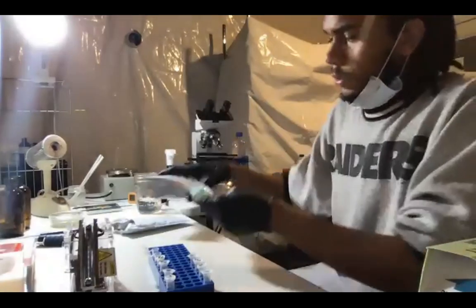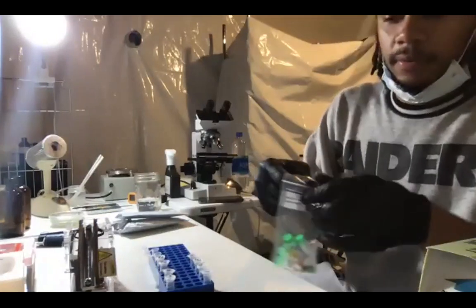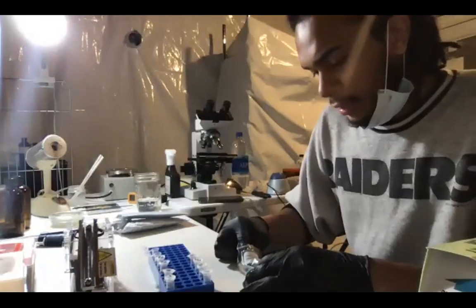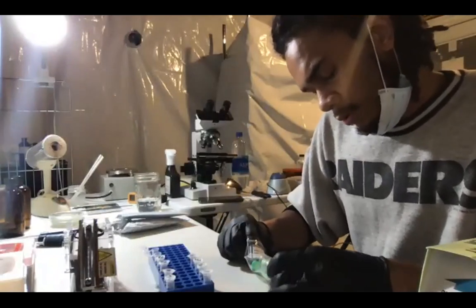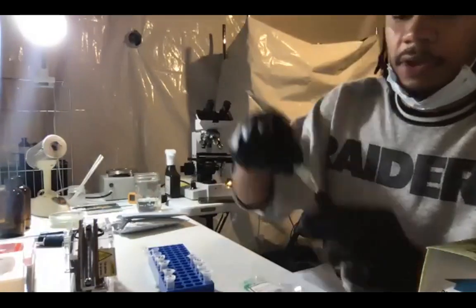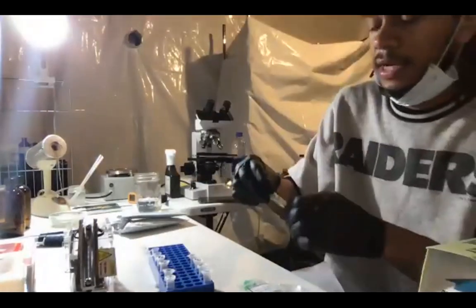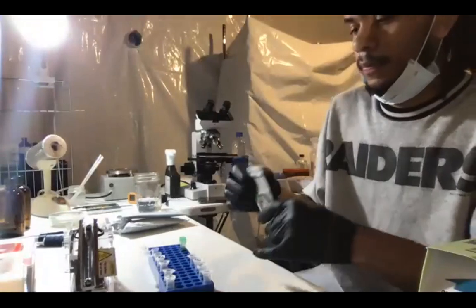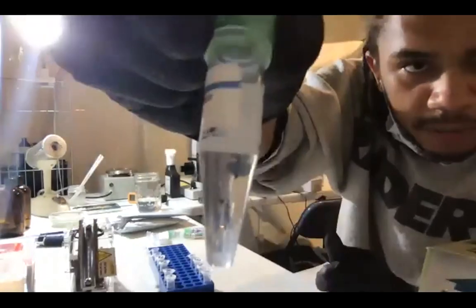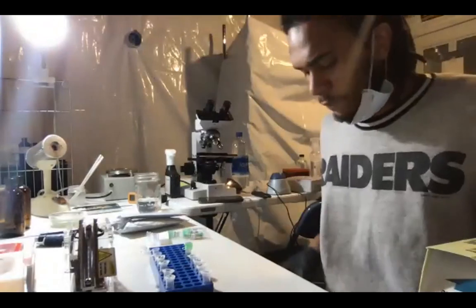And I get my master mix from the Odin. That's the company I mentioned before that sells laboratory supplies. This is what you want. You want 2X Taq master mix. Taq polymerase, so it has the polymerase in there. And they give you a nice full centrifuge tube of master mix. Pretty affordable for what it is.